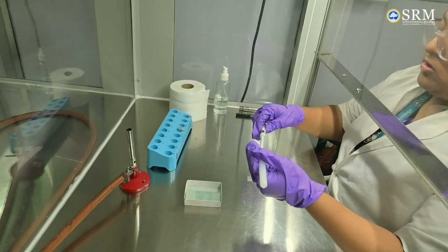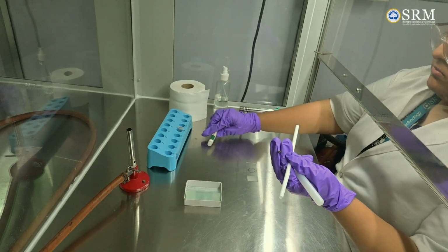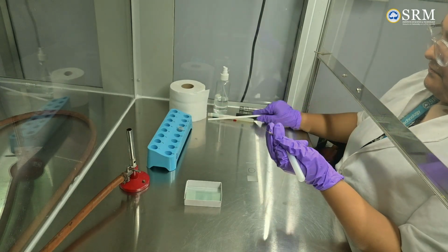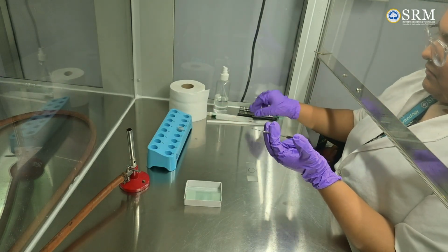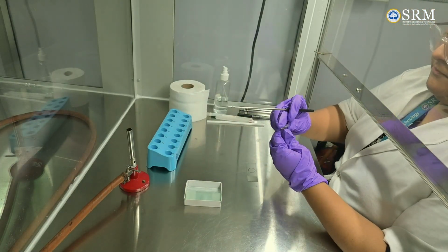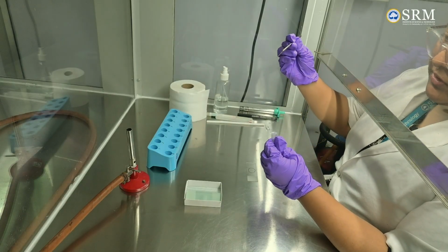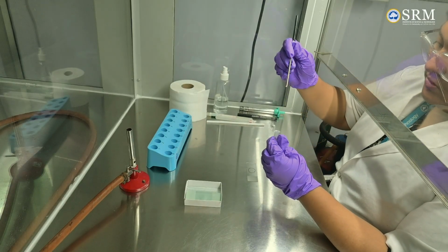We take the inoculum tube, this is our overnight broth, and take some amount of it with the inoculating loop and make a smear on the circle.